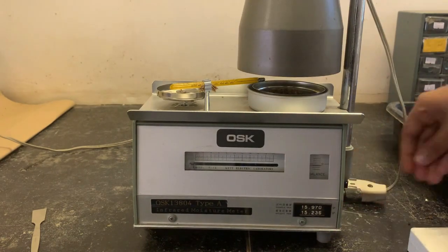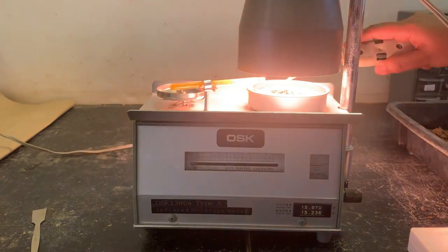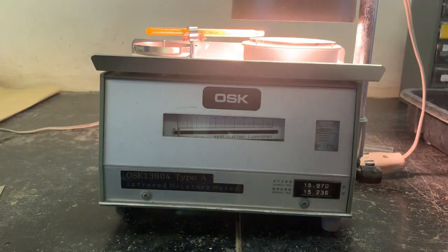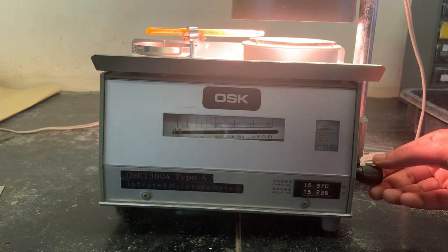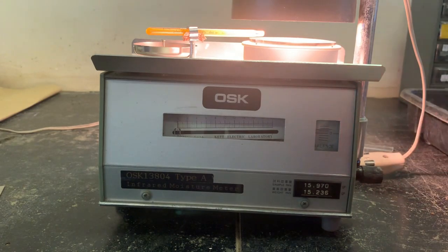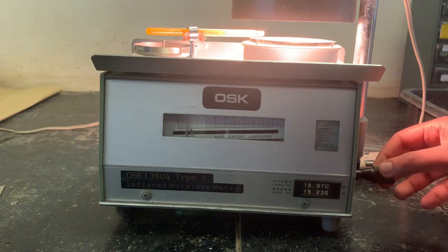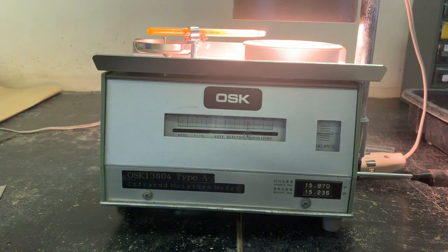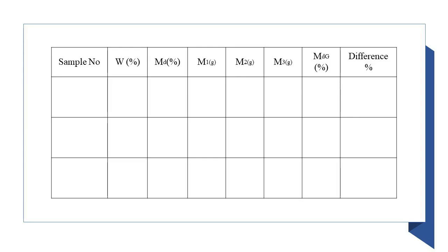Then turn the power switch on. As the sample dries, the balance indicator moves upward. Make zero balancing by sliding the indicator with the knob. When the balance indicator stops completely, it means the sample has been fully dried. And now we can directly read the moisture percentage of the sample on the scale.